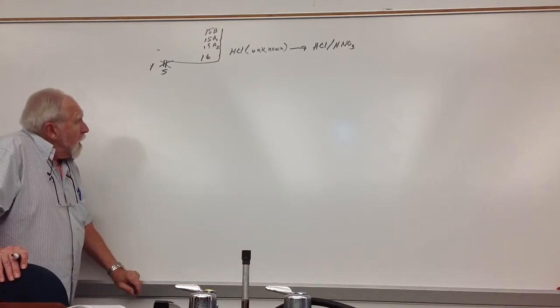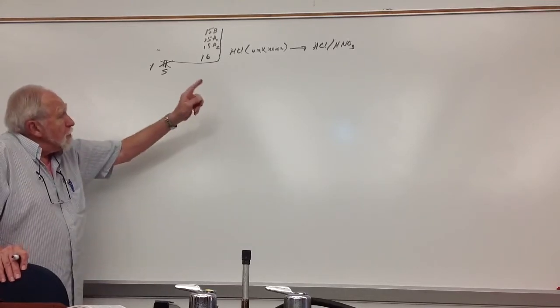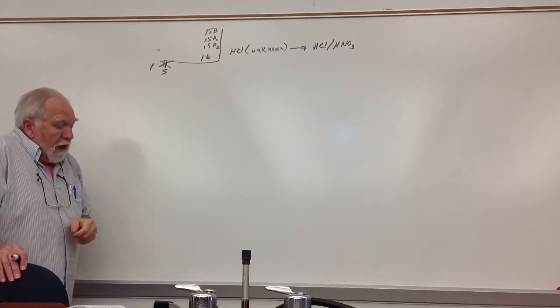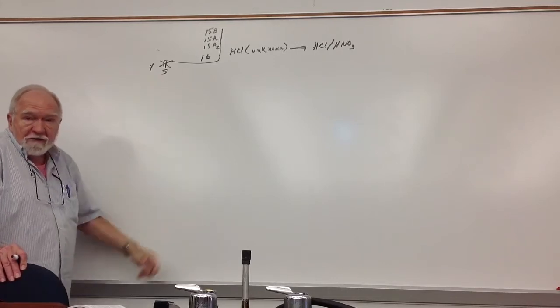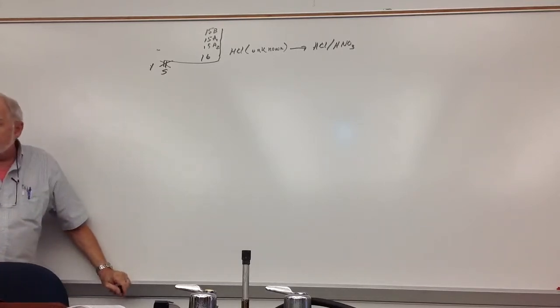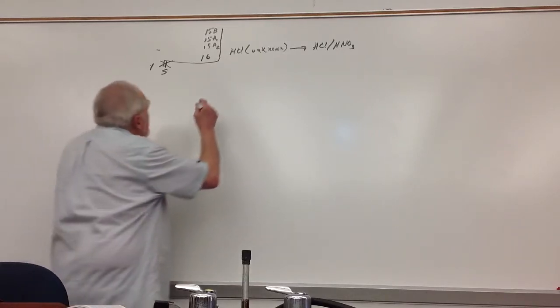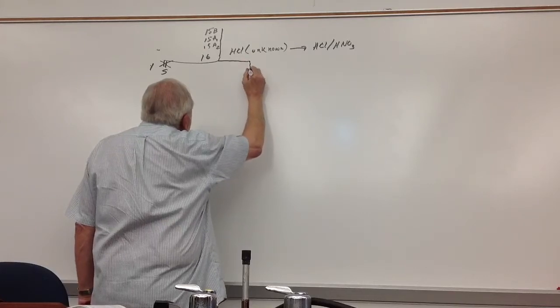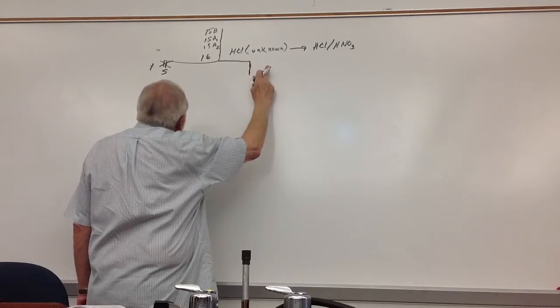Okay. So when you're doing these treatments, you always replenish with the appropriate acids. It was actually the aqua regia back there also. Until finally, the only thing that's left is the yellow lump of sulfur. Procedure 7, if you have a gray precipitate left after you've been treating with aqua regia, the message is you didn't treat long enough. Okay? Over here, you're going to have all the ions in solution. I did those equations for you.